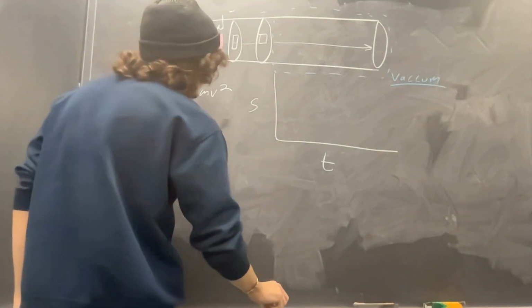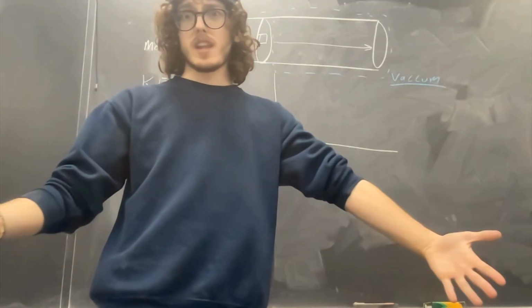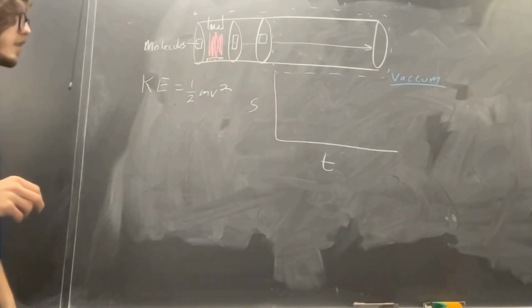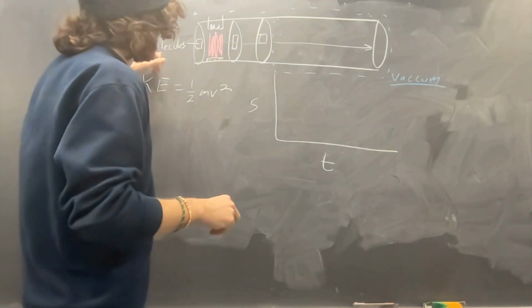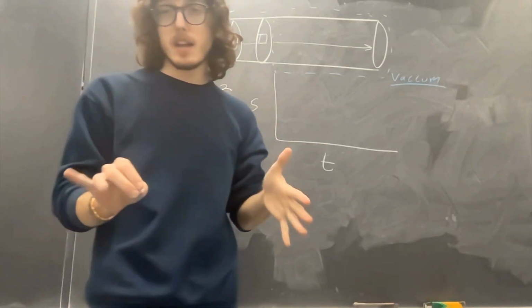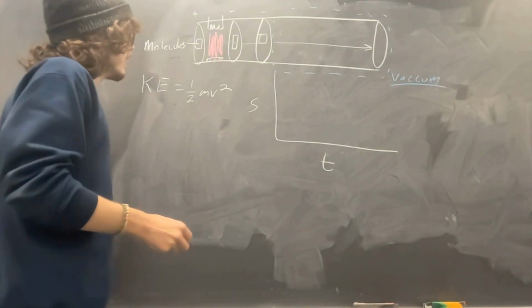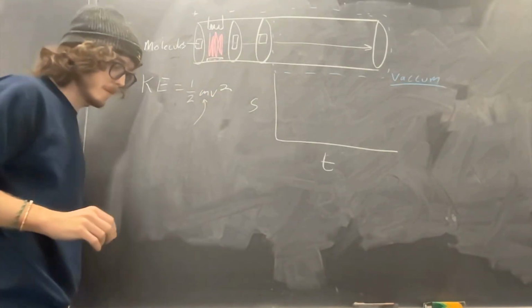So the time-of-flight machine is under vacuum, and the molecules go in and fly. So what is separating them? There's no physical moving of the stuff. It all has to come down to KE equals 1/2 mv squared. When you accelerate these molecules, hopefully they're going to have roughly the same amount of kinetic energy. That's a given. But we know that their velocities are going to be different because of this m term here.